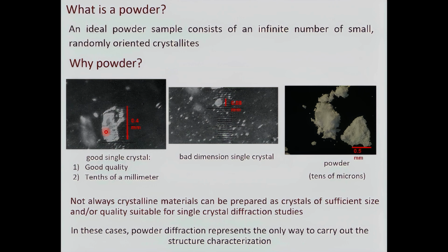But I want to show you that even though we have many problems with powder, all the information about your compound is inside the diffraction pattern. It is difficult, but all the information is there. The difficulty is to recover this information in a correct way, but it's there.